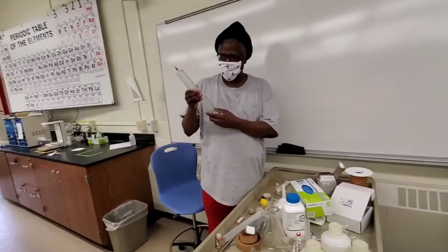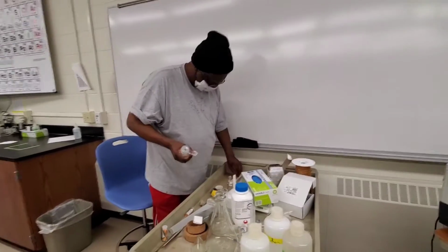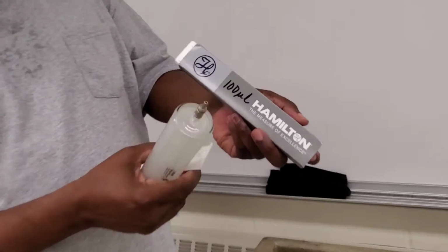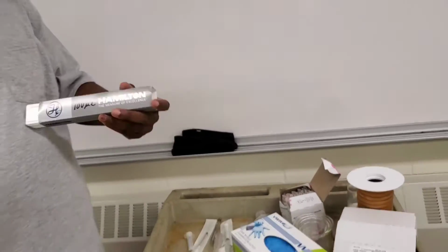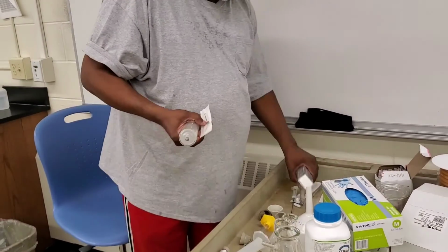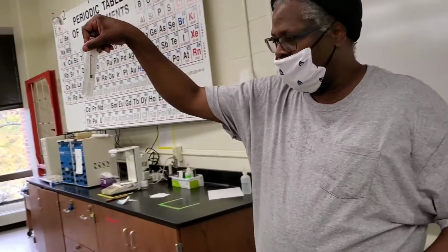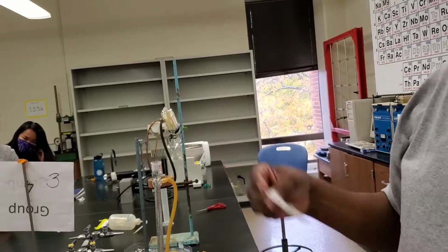And we have big syringes, and we have small syringes. Okay? We have really tiny syringes, like this one that hasn't even been opened yet, and it could pull up 100 microliters. It's really tiny amounts. Some of the syringes are glass, as you can see here, and some are plastic. The ones that we probably will use the most are these. These are 1 milliliter syringes.